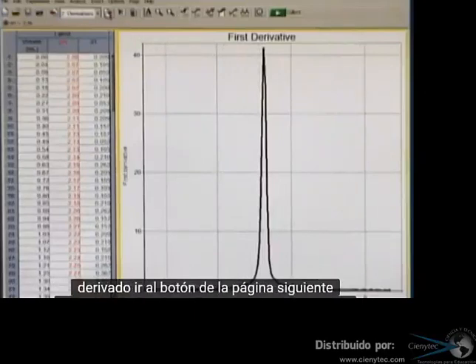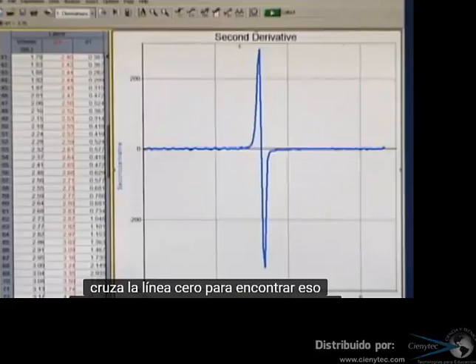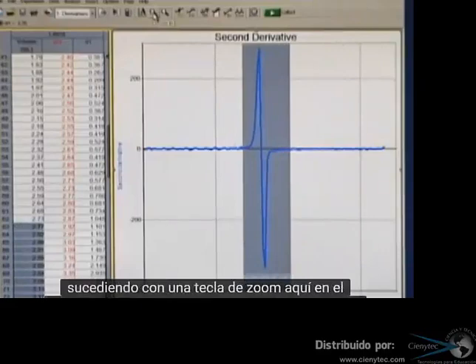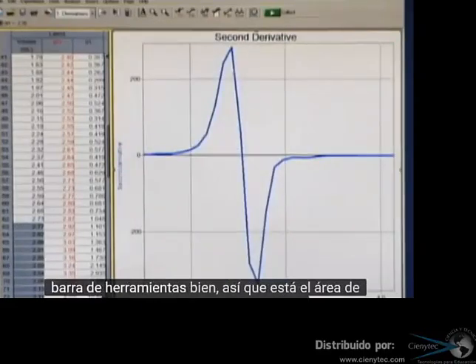Even better than first derivative though is second derivative, so I'm going to close out this first derivative, go to the next page button again, and here's our second derivative, and our equivalence point is going to be right where that second derivative crosses the 0 line. So to find that point exactly, I'm going to zoom in on this whole area where that action is happening with the zoom key here on the toolbar. All right, so there's the area of interest.